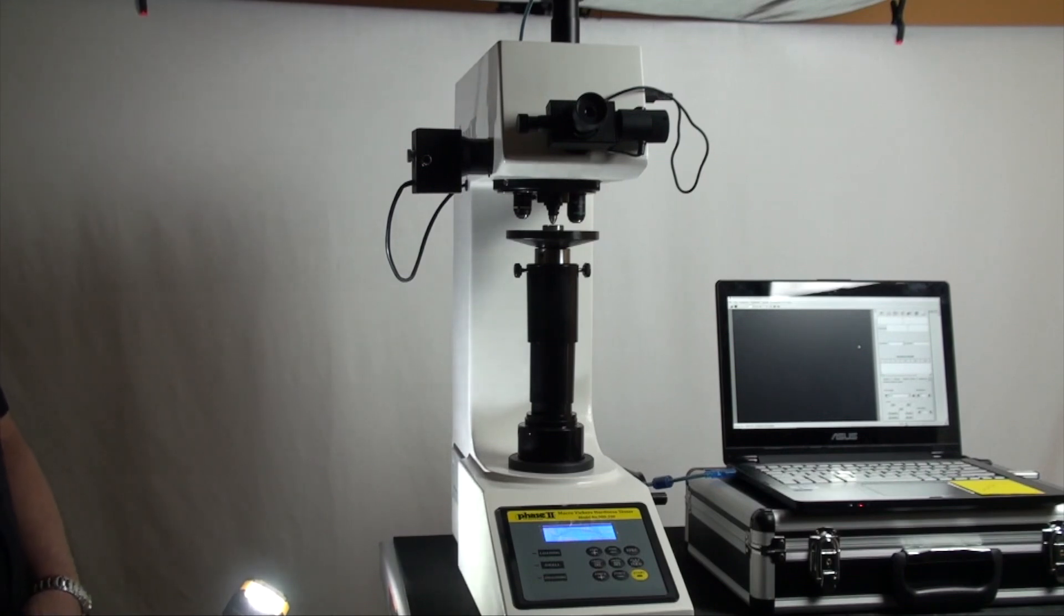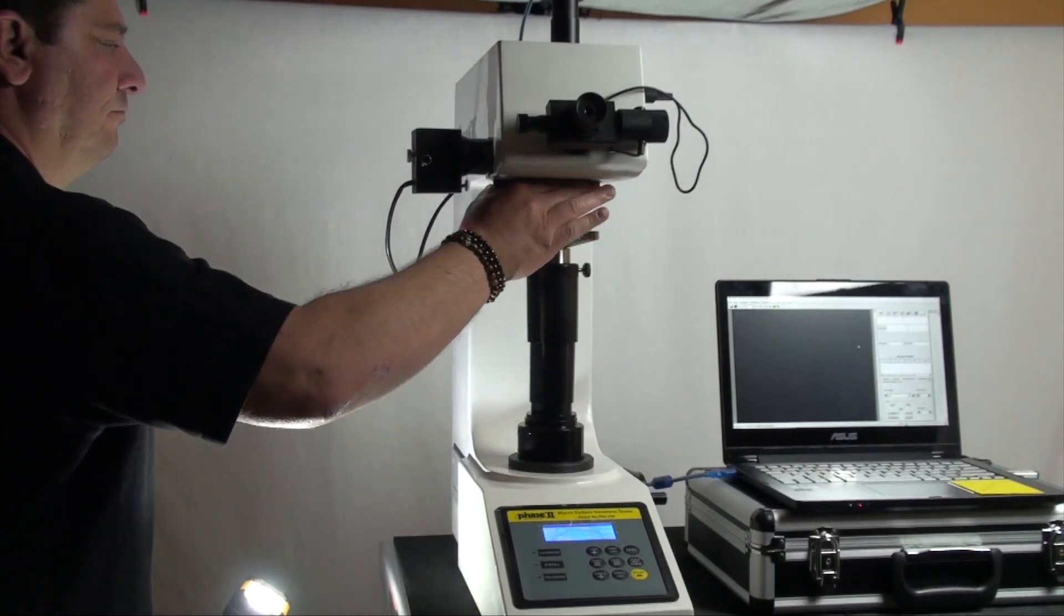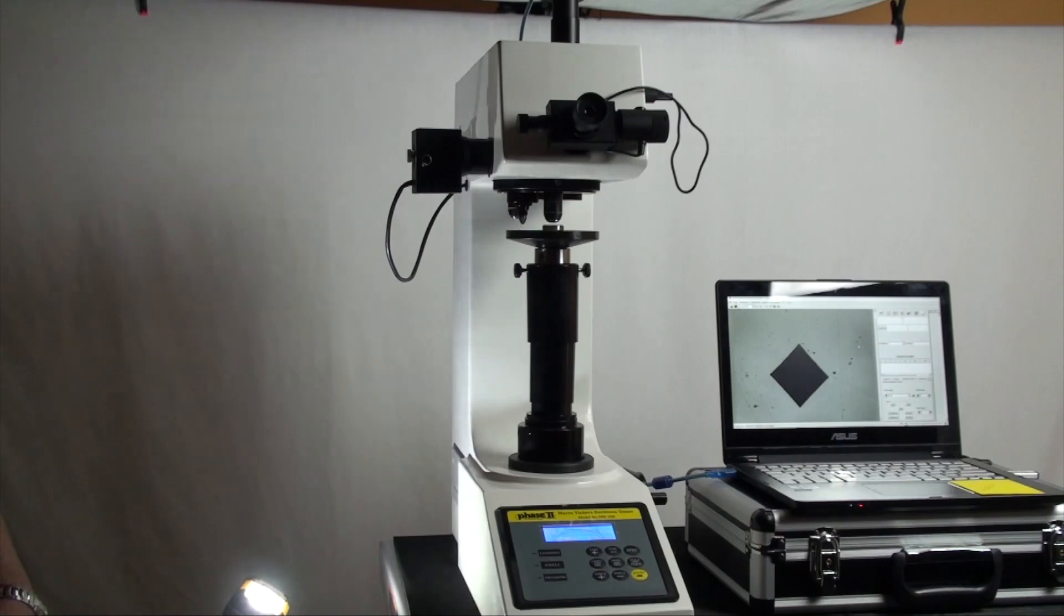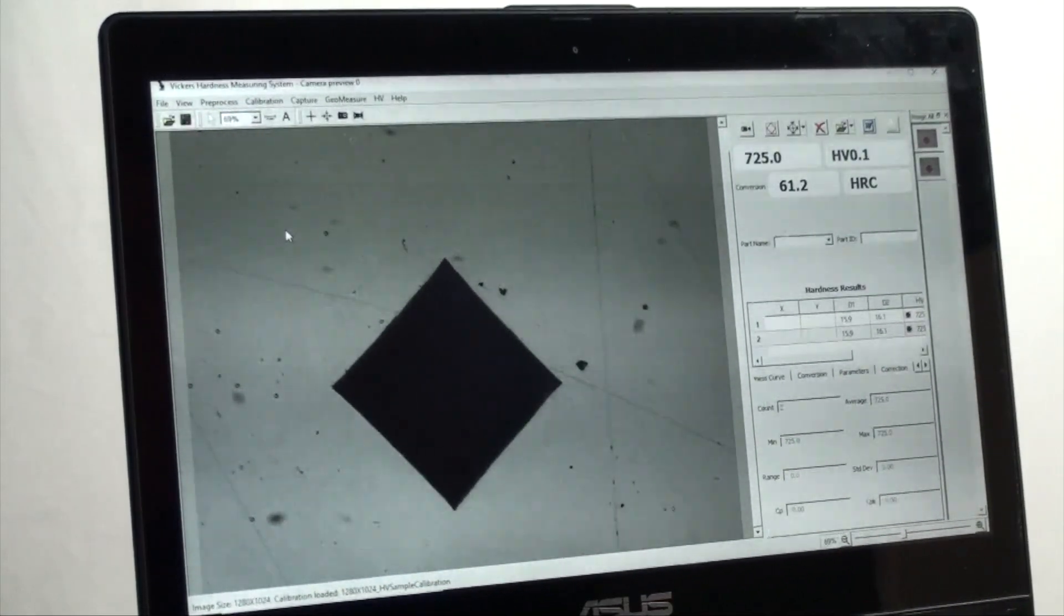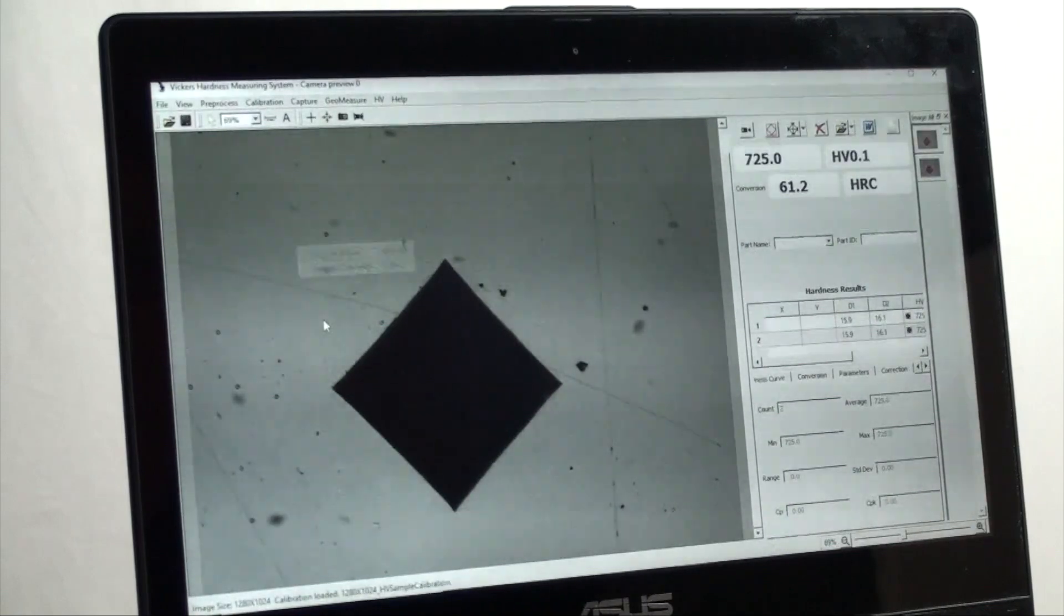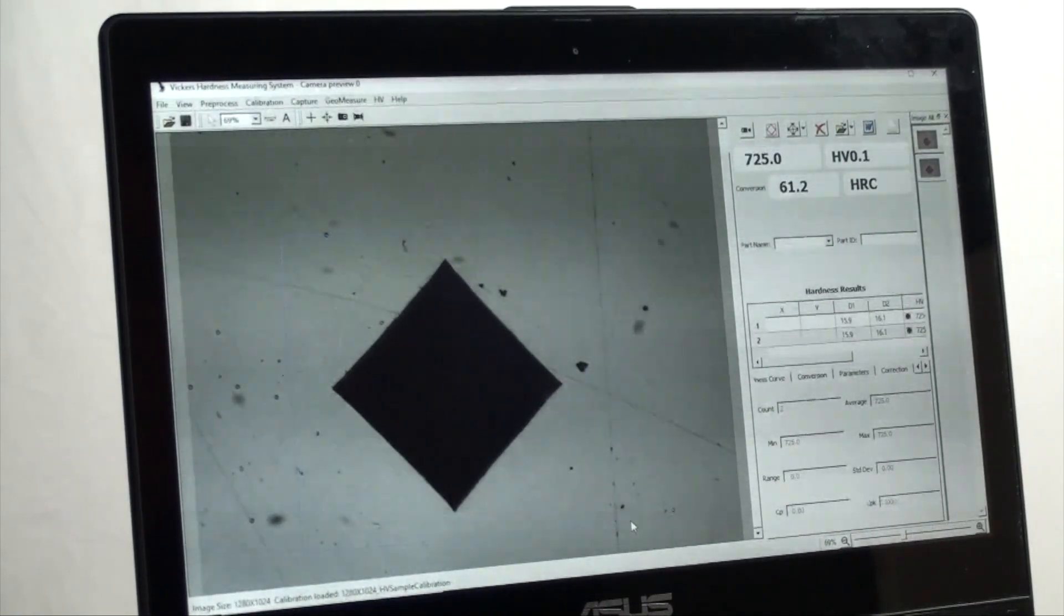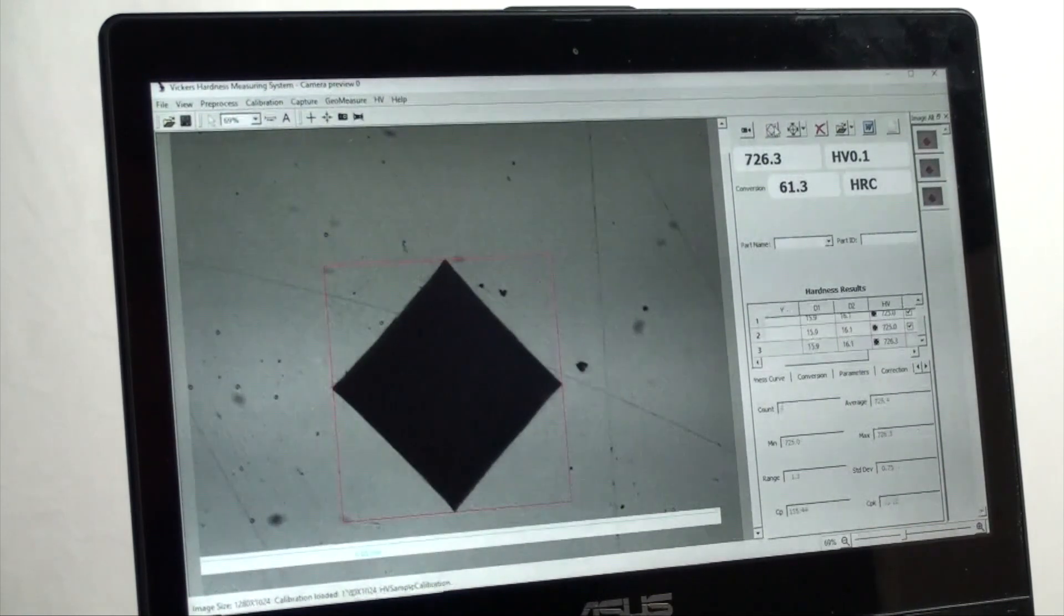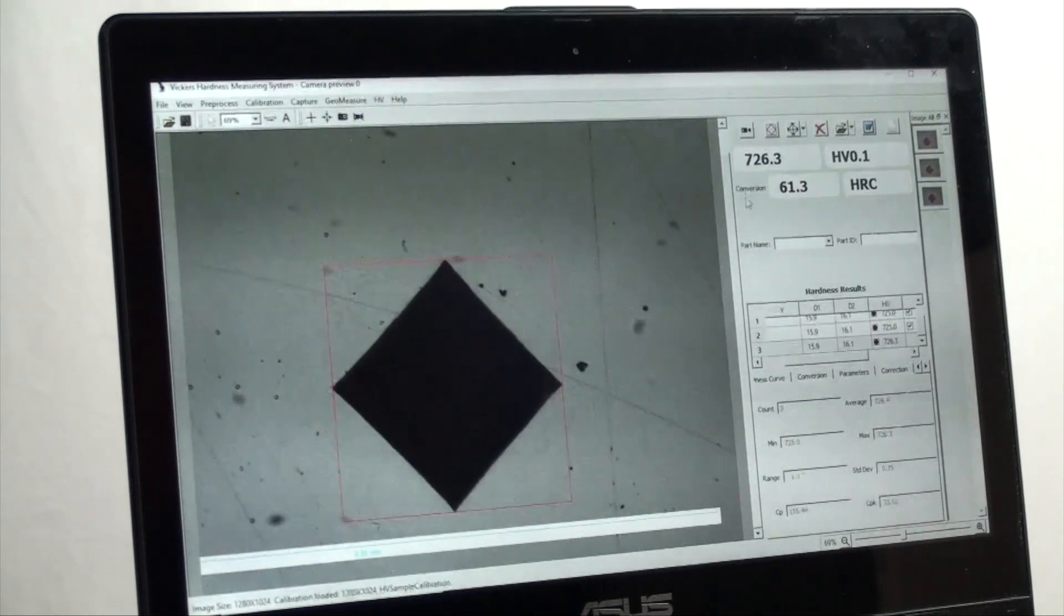Upon completion, manually change the turret back to the 40x optics to see the indentation made and begin measurement on the computer screen. Mouse select a square area over the indentation. Select auto measure if using the B version and the reading will appear along with any converted value if so chosen.